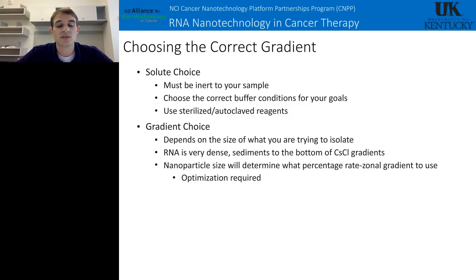And it goes throughout this entire presentation that it's very important to use sterilized and autoclaved reagents. In our lab, we always autoclave all of our tips, our tubes, our buffers. You need to do that to make sure you prevent degradation of your samples.